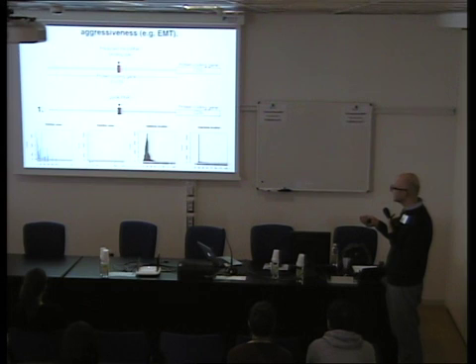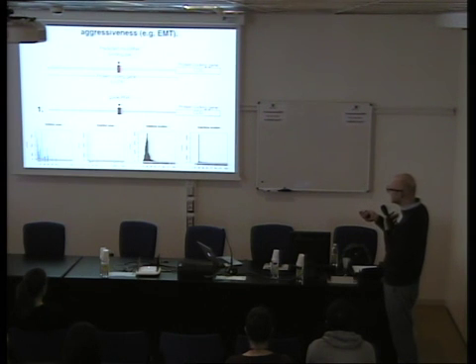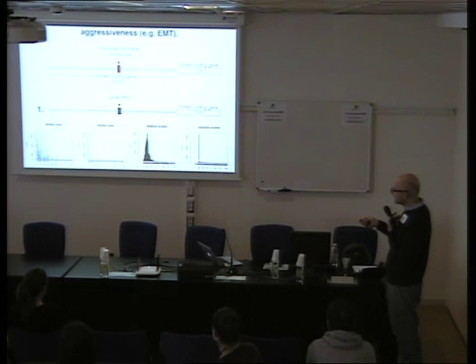Only one nucleotide. And this is the location of the deletion, and the peak is here, exactly between the 3rd and the 4th nucleotide where the Cas9 should generate the double-strand break. And these are the locations of the insertions. That is the same nucleotide.